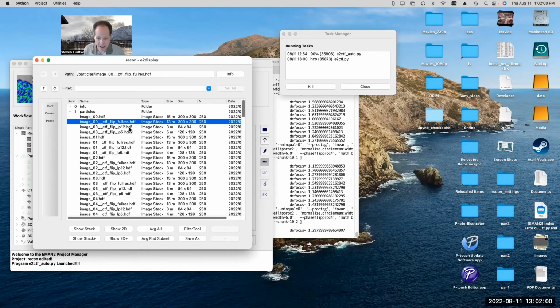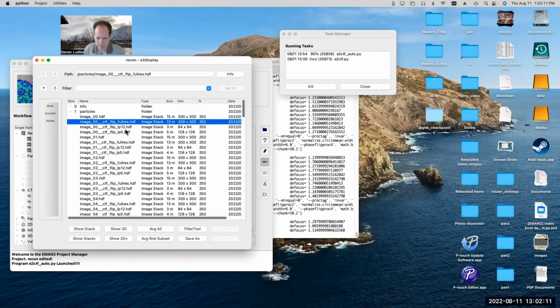You don't necessarily have to use these at all. You can just jump straight to the full resolution data for certain cases. It just depends. Most of these other files are about making things go faster rather than about getting better final results. For the final results, you'll always use the full resolution data.